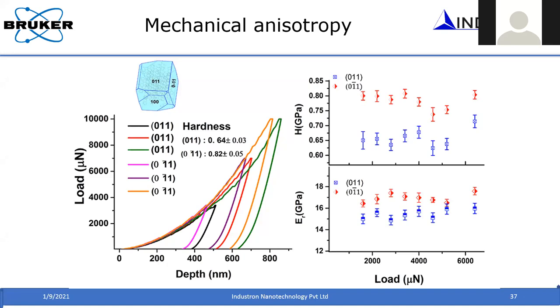If you wanted to image at nanonewton or less than nanonewton, it is possible. We have a transducer, which we call a MEMS transducer, which can go down to piconewton forces, and you can image like an AFM. We are able to image very soft samples with that too.